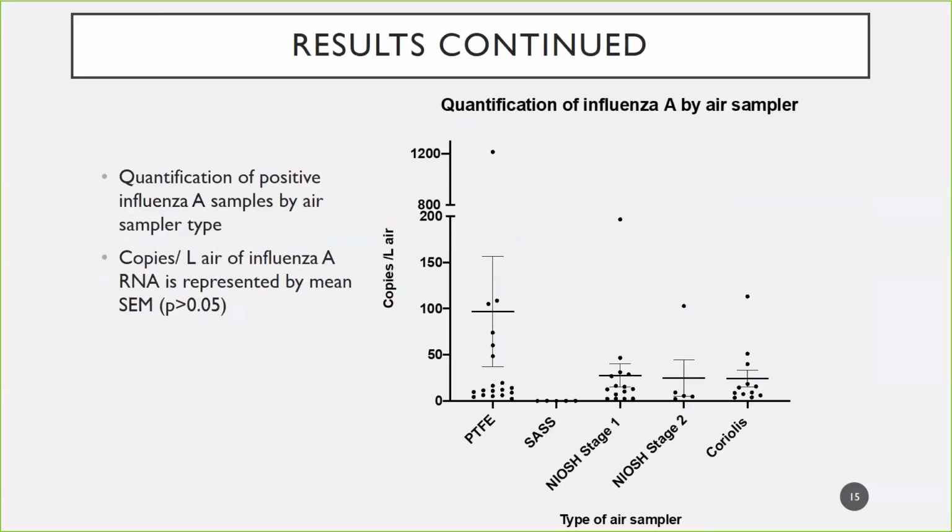I also wanted to see if there was any difference between the air samplers in the amount of copies per liter of air of the influenza A virus RNA that we could find in the air. However, there was no significant difference between the air samplers. Next slide.